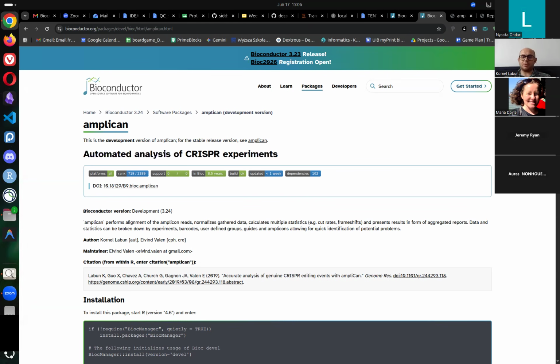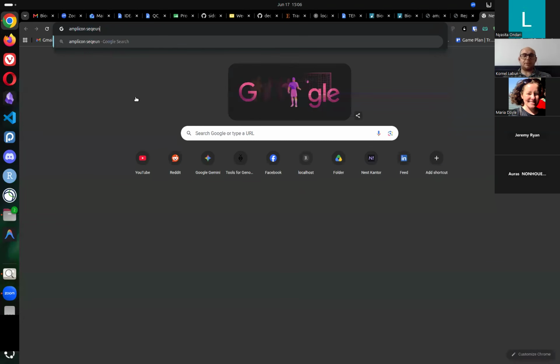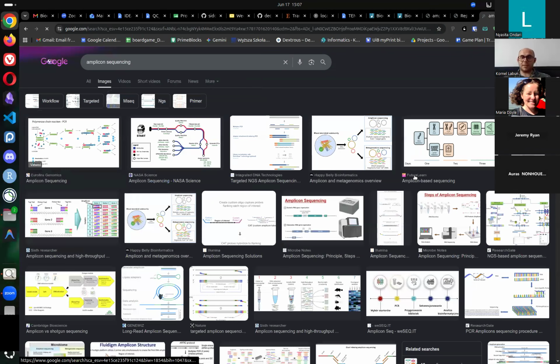So if you Google amplicon sequencing, I don't really have a presentation ready for today. I didn't have the time to prepare it, unfortunately, so it will be a little bit back and forth. Hope you can see this.